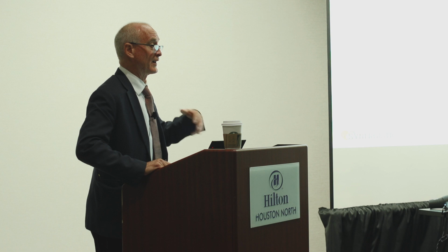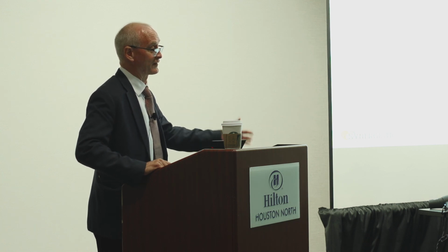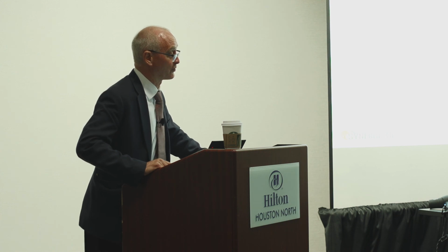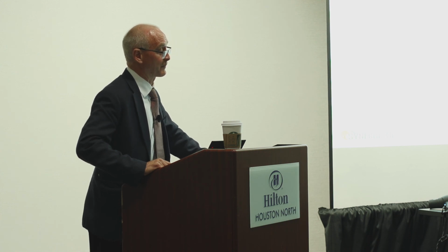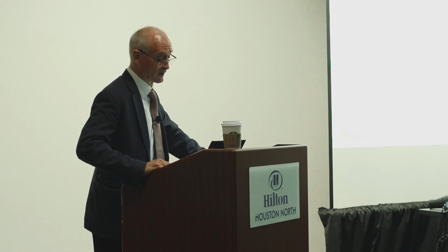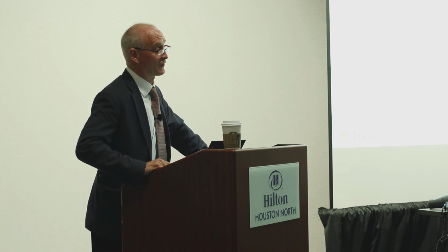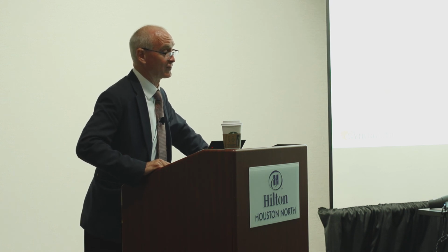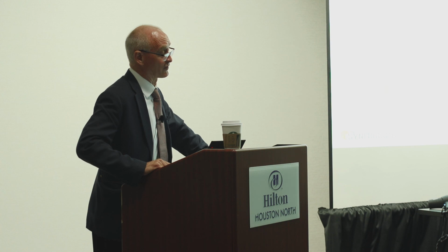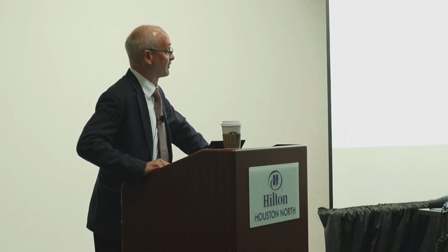And so you can have data that you hadn't expected to have a loss when that doesn't make any sense, but there's no way for you to have known that that effect happens. The next effect is you can start to do more of these studies that allow you to look at, does water make a difference? Is it doing something else besides just the processing? Is there another way of getting rid of the water up front so that you're able to really optimize the entire process and not have the water included?